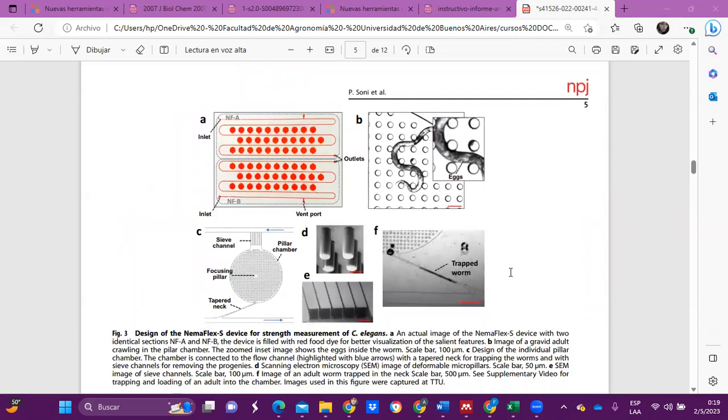In this view here, you can see the layout of the NemaFlex device that consists of two identical sections of TRT chambers, each with pillars. The presence of two separate sections allows redundancy in case one section clogs and also reduces pressure drops during animal loading. Each section has a single inlet, a single outlet, and a side vent port to remove air bubbles. The pillar chamber wall has a diameter of three millimeters to allow the one-millimeter-long adults to move freely within the pillars arranged as a square lattice.